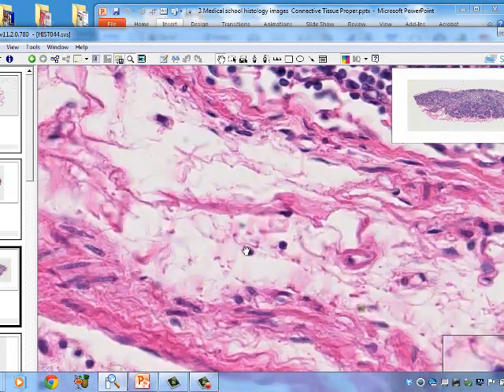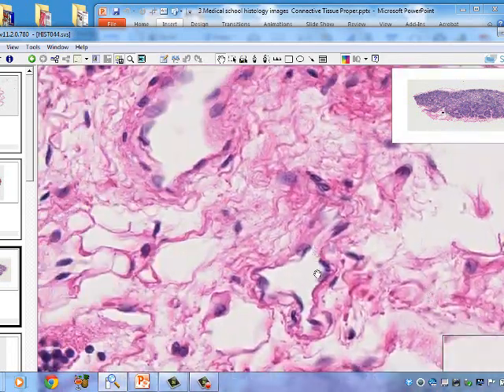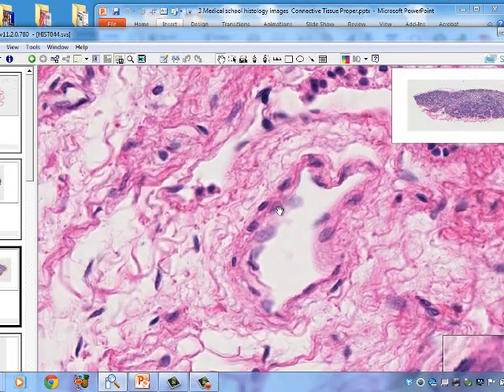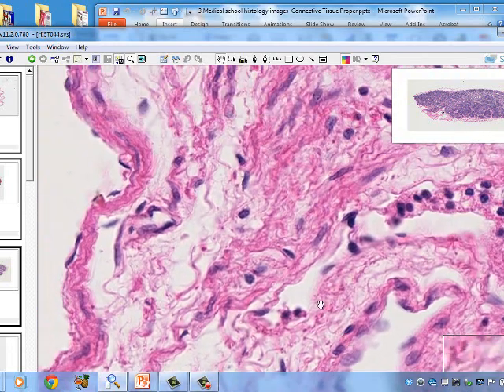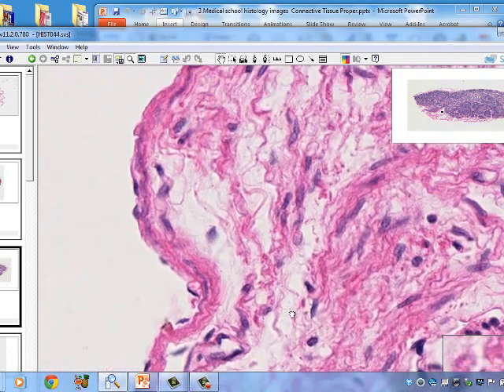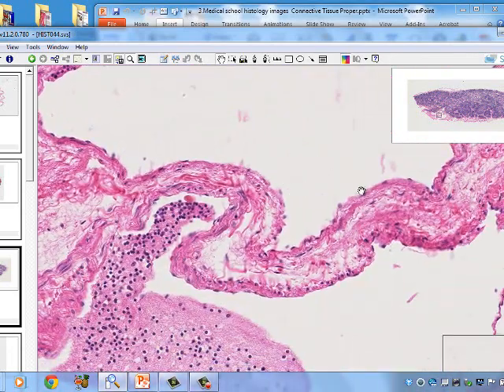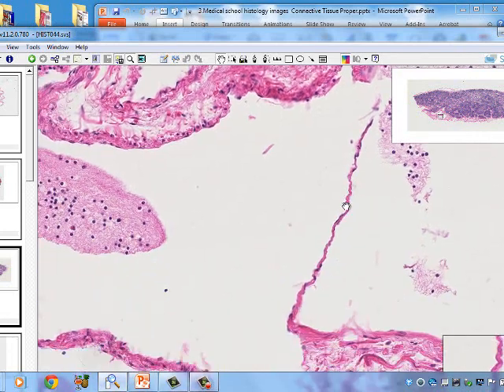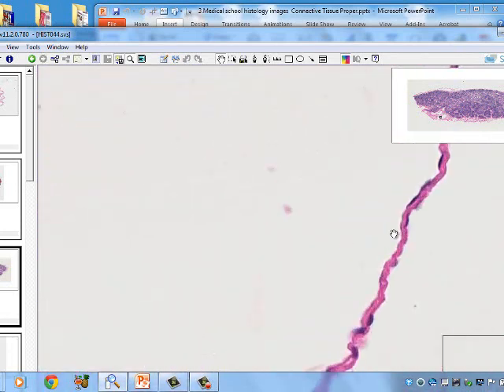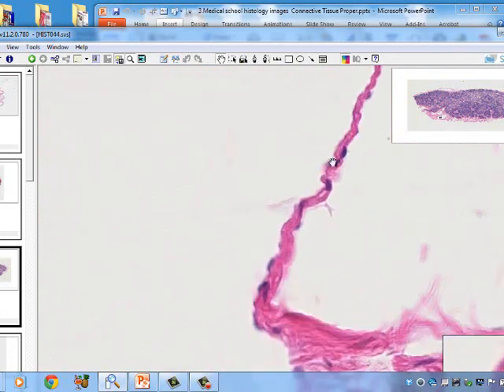We're looking at the connective tissue around the lymph node. There's a blood vessel with endothelial cells forming a small capillary, and pink smooth muscle cells on the outside. A small vein is visible in two places, showing the valve of the vein with its endothelial cells and connective tissue core.